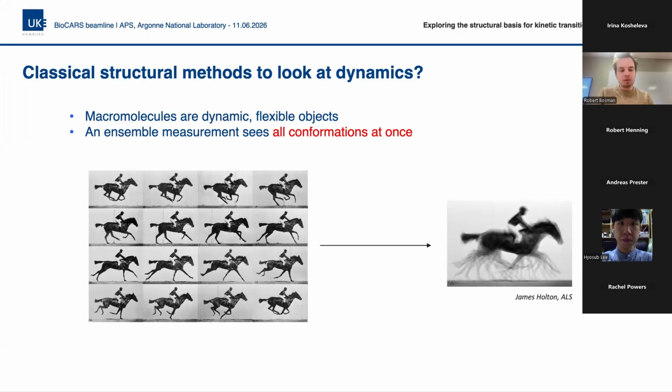So we end up with all of these potential dynamics happening at once, or potentially just a subset, because we typically measure at very cold temperatures, essentially a resting state system. And so we either don't have certain dynamics occurring in our crystal, or we don't have a defined set of which dynamics are functionally relevant.